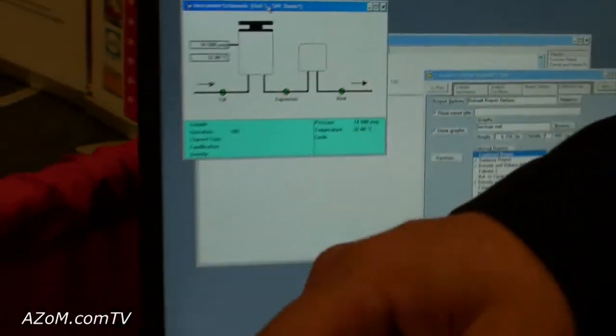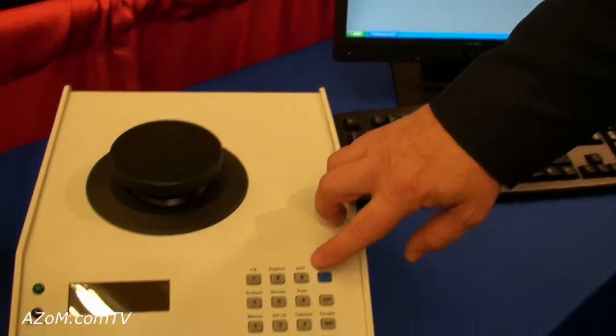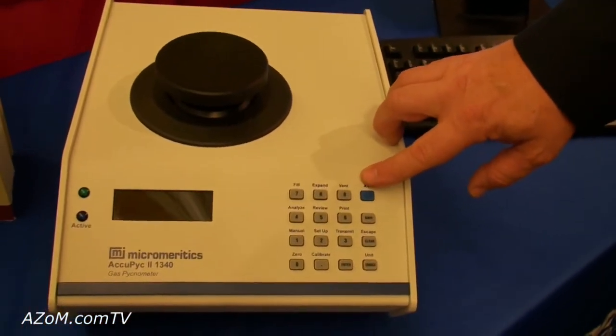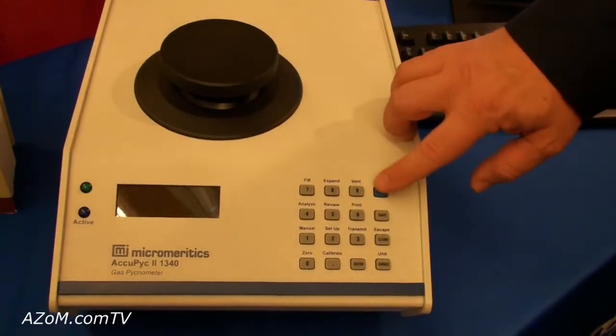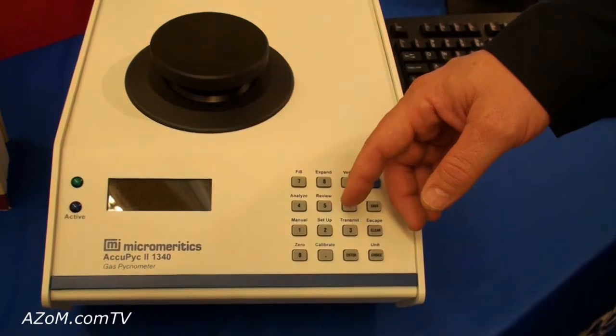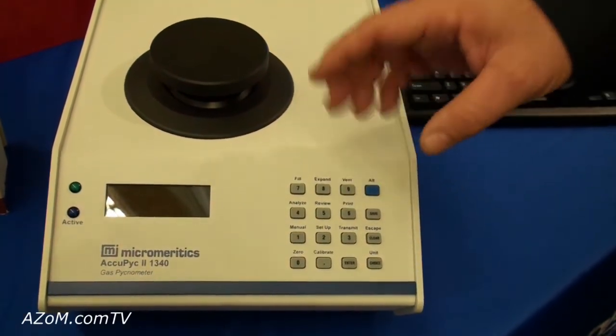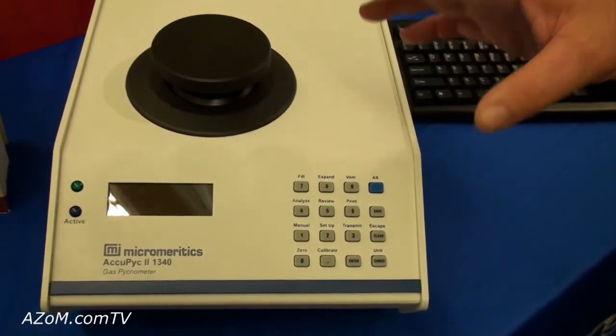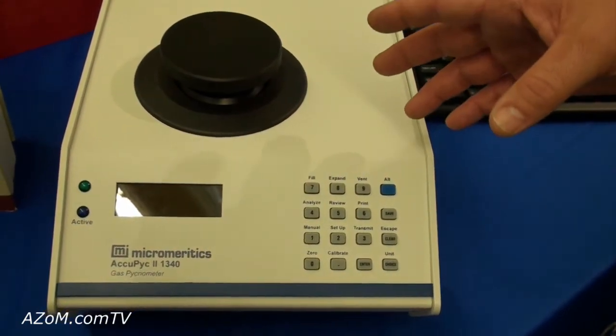The instrument can be controlled via the keypad here so that you can start an analysis by simply pressing the analyze button, entering a sample identification and a sample mass. What the instrument is really measuring is the volume of gas displaced by a sample.